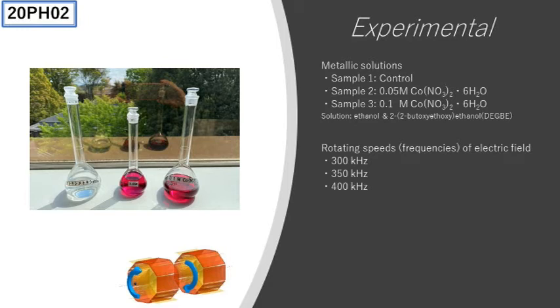Generally, a typical charge-to-mass ratio converges to the center at a typical frequency. But in this work, we didn't specially define a typical frequency of mass from these frequencies.